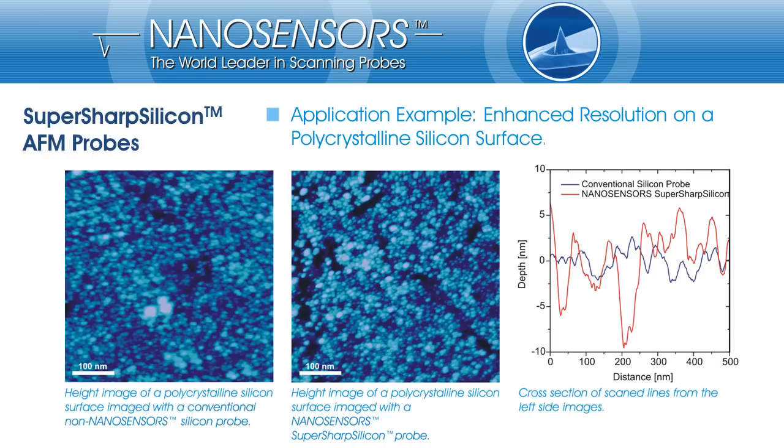A polycrystalline silicon layer was imaged either with a conventional silicon probe on the left side and a NanoSensors SuperSharp Silicon probe in the middle. Again, with a NanoSensors SuperSharp Silicon probe, the sphere-like structure of the polycrystalline silicon appears much sharper. Also, the interspace between the sphere-like structures is imaged much better with a SuperSharp Silicon probe than with a conventional silicon probe.